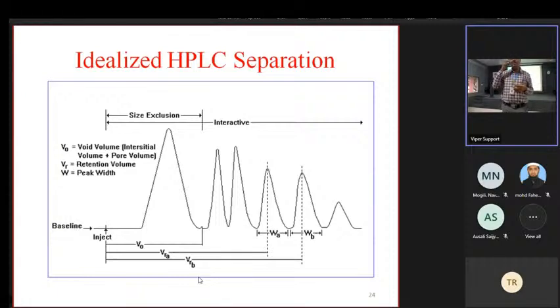Thin layer chromatography is a manual technique. We have HPLC also, but thin layer chromatography just uses plates. We apply a sample on the plate, then develop it, and the components separate. We are not really identifying, we are just looking at the samples under the light to see whether they have separated or not, and based upon the RF value, what those components are. But with high performance HPLC, we are not only separating, we are also identifying qualitatively: this is the quantity it contains, this is the retention time.